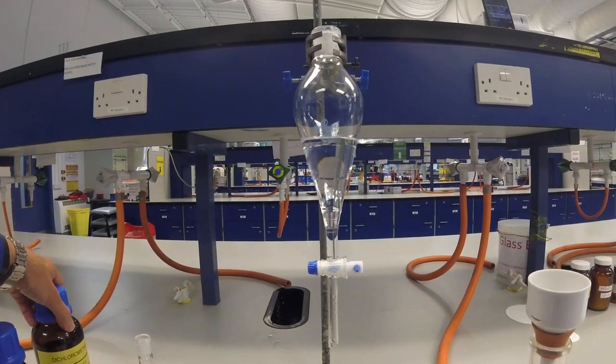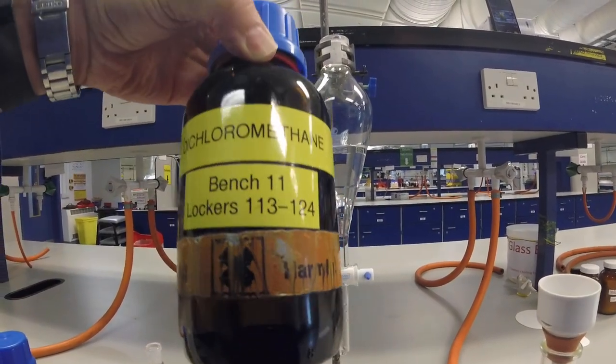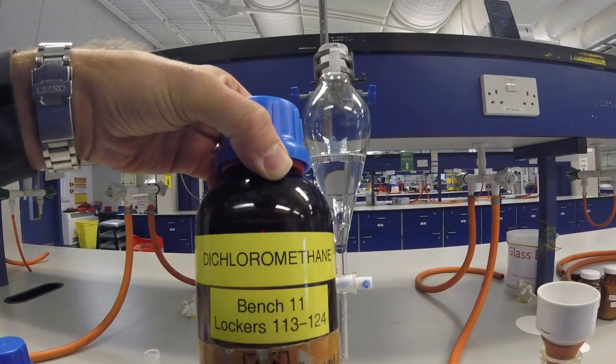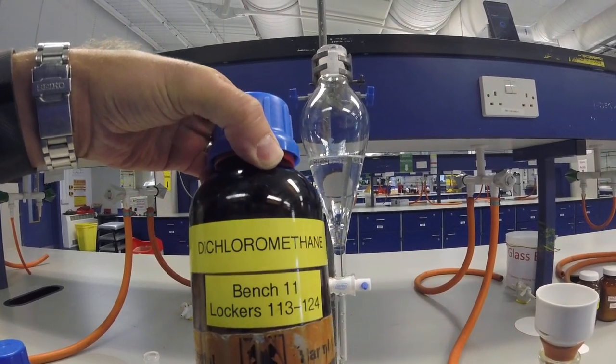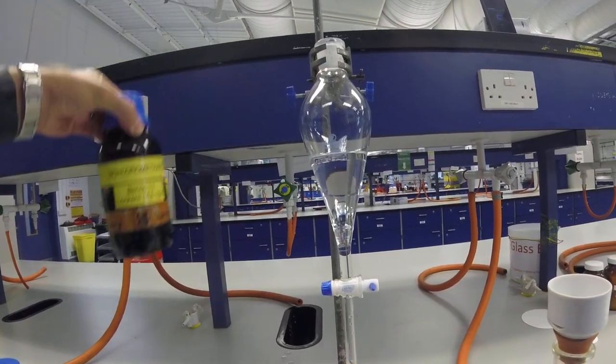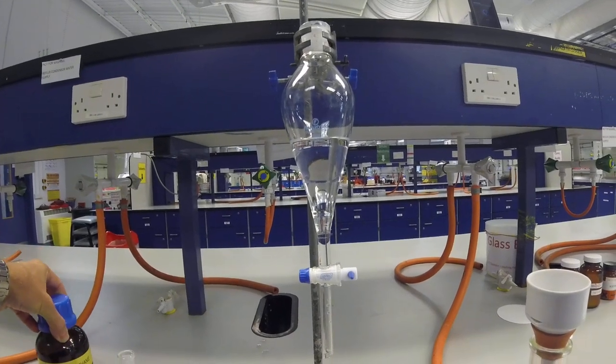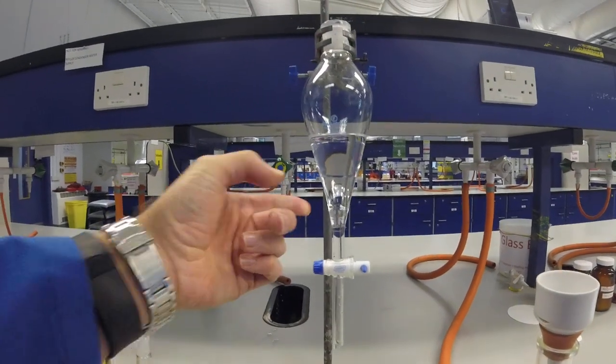The only difference comes when you get things like dichloromethane. So dichloromethane and chloroform, chlorinated solvents, are much more dense than water and so in separation they'd be on the bottom.